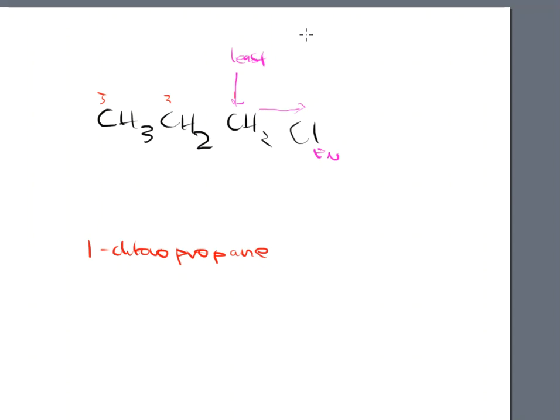And it's due to the electronegative chlorine that is present. The electronegative atom is sucking electrons, and that sucking noise is pulling those electrons away, so this is the least shielded out of the bunch. So when we talk about shielding, we are talking about the electron density almost every single time with this, right? Remember, shielding is all about positives and negatives. That is how NMR works. It's by a series of magnets.